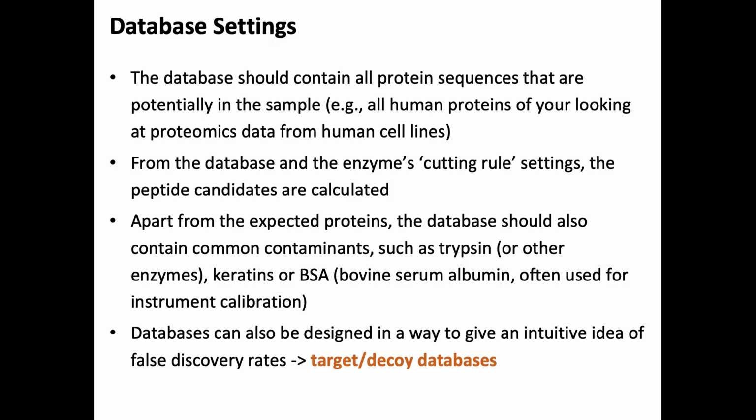So try to make sure that whatever you have in your sample is covered by the database, and we discussed that earlier already. Try not to be super inclusive, because if you put the whole world in there, then the odds of just having random mismatches will increase as well.